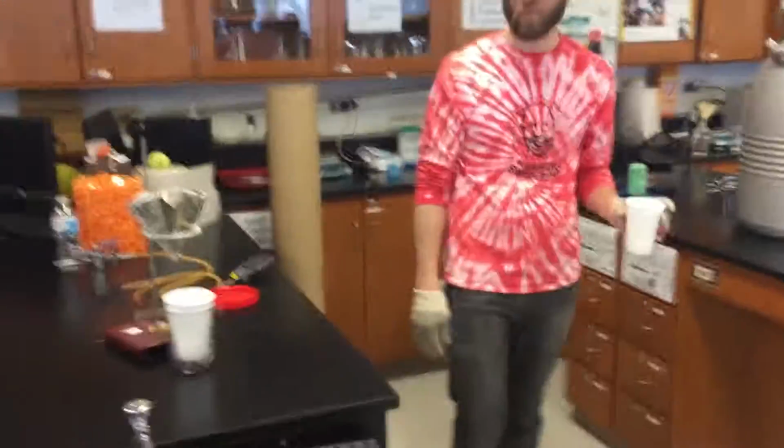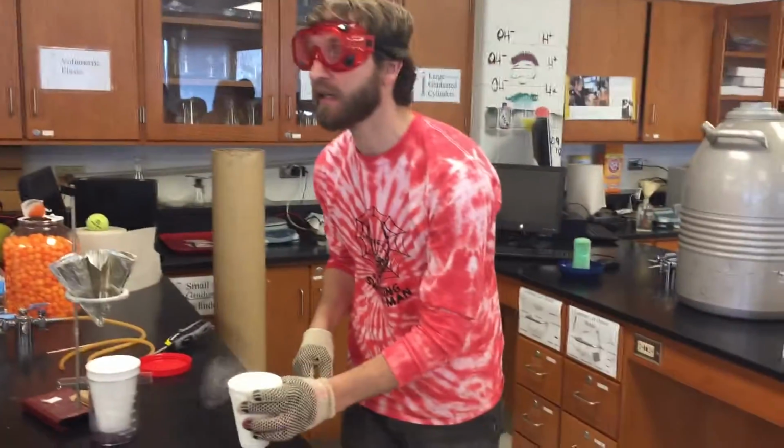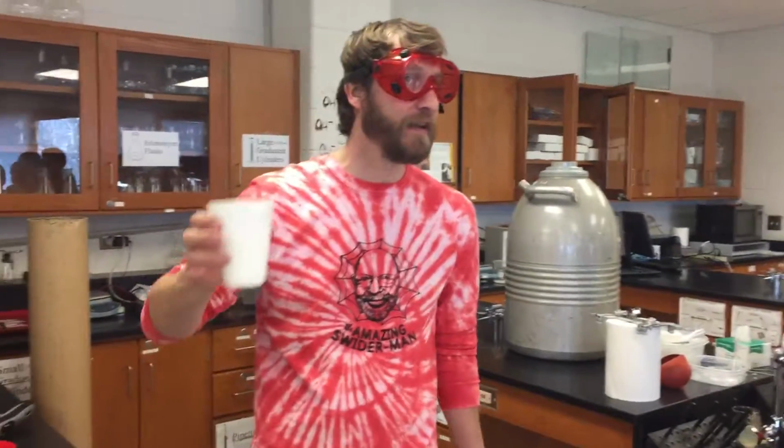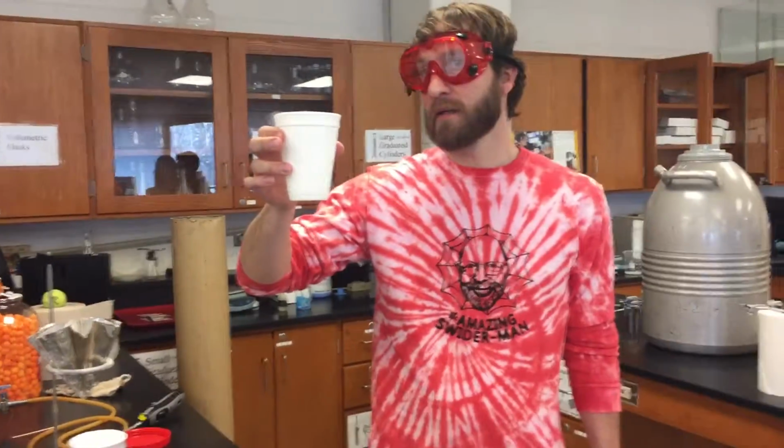What if you touch it? It can give you frostbite very, very quickly. Actually, when I poured it the first time, some stuck to this glove and actually just about gave me frostbite, so these gloves are useless. I'm getting rid of them. All right, now I'm going to do something very dangerous.